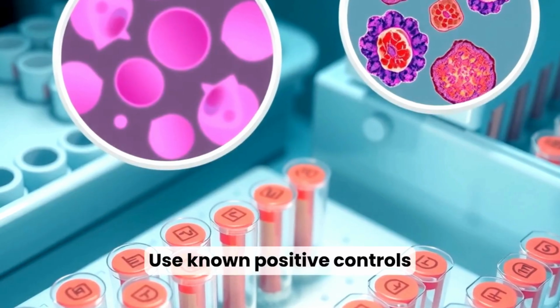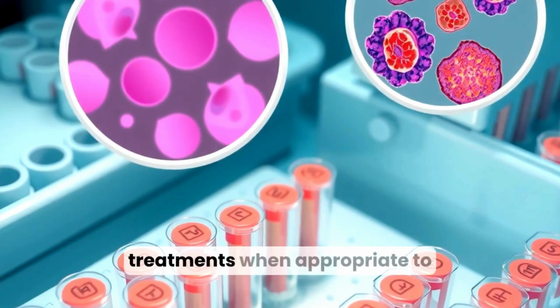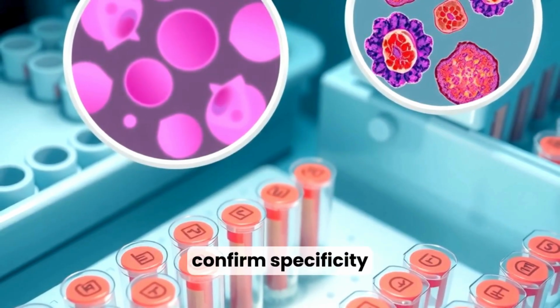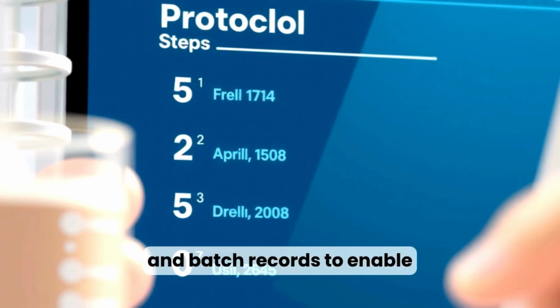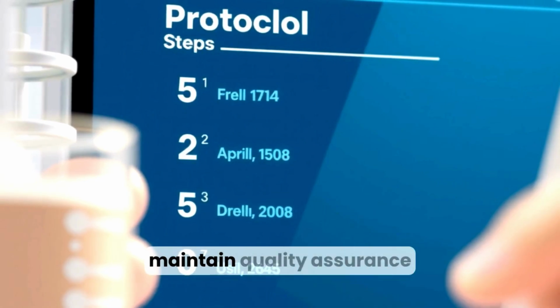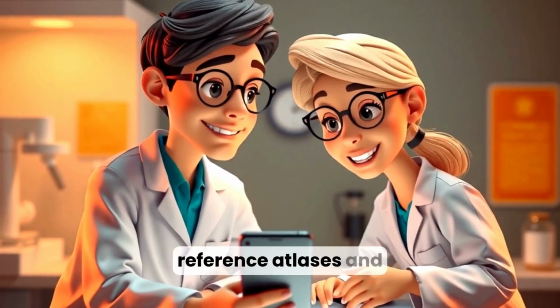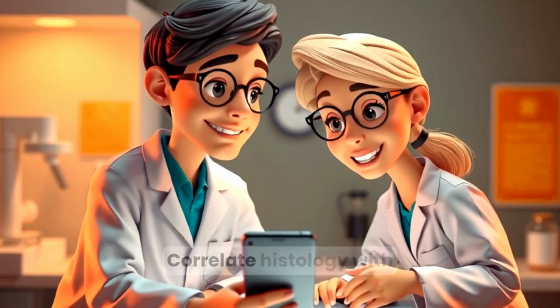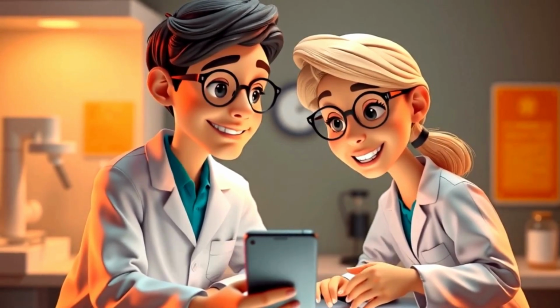Use known positive controls for each stain and include negative controls or enzyme treatments when appropriate to confirm specificity. Document staining protocols and batch records to enable reproducibility. Good records speed troubleshooting and maintain quality assurance. When uncertain, consult reference atlases and experienced colleagues. Correlate histology with clinical information for accurate interpretation.